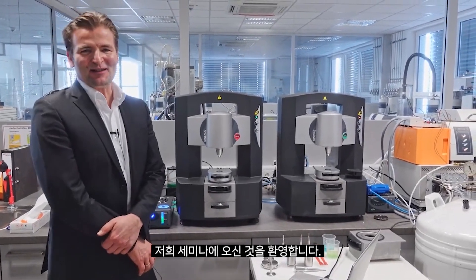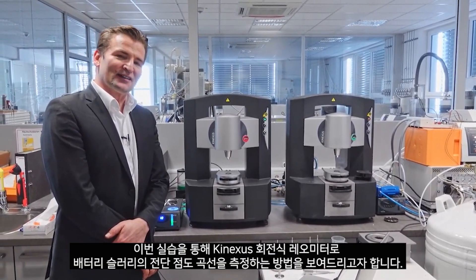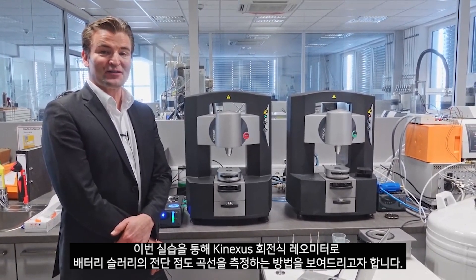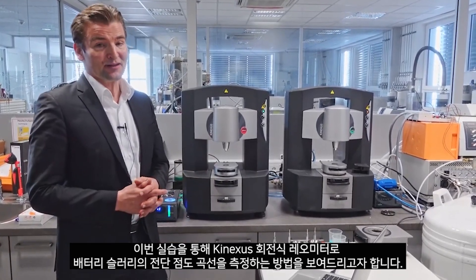Welcome to the second part of our joint webinar. My name is Thorsten Remmler and I would like to show you in this practical session how to measure a shear viscosity curve of a battery slurry with our Kinexus rotational rheometer.